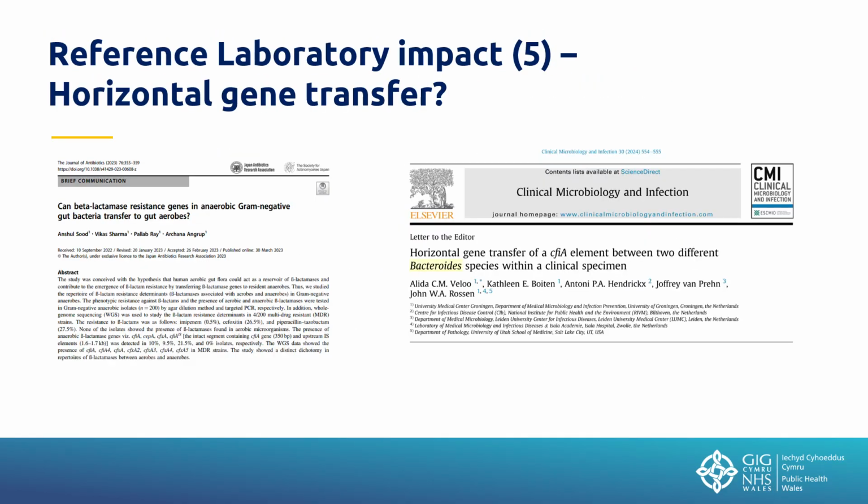The fifth major impact on reference laboratories is the determination of horizontal gene transfer.